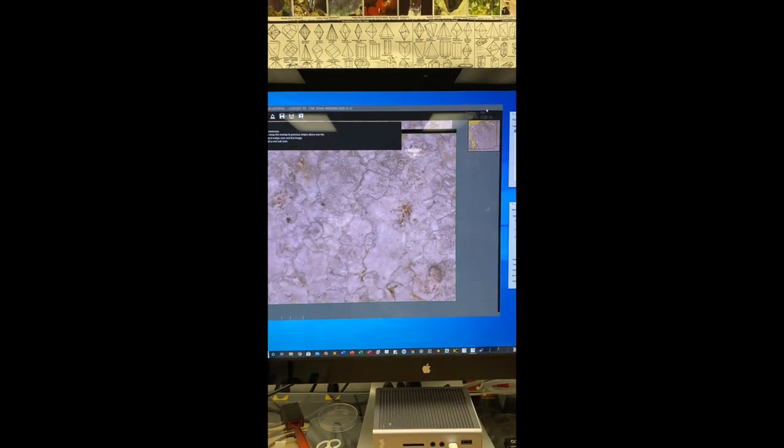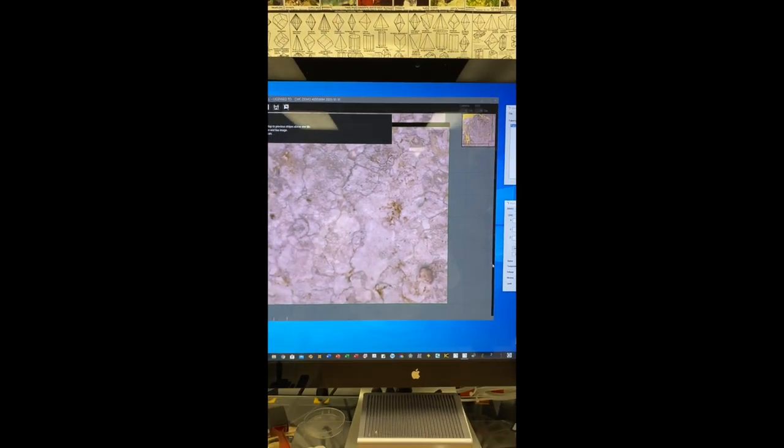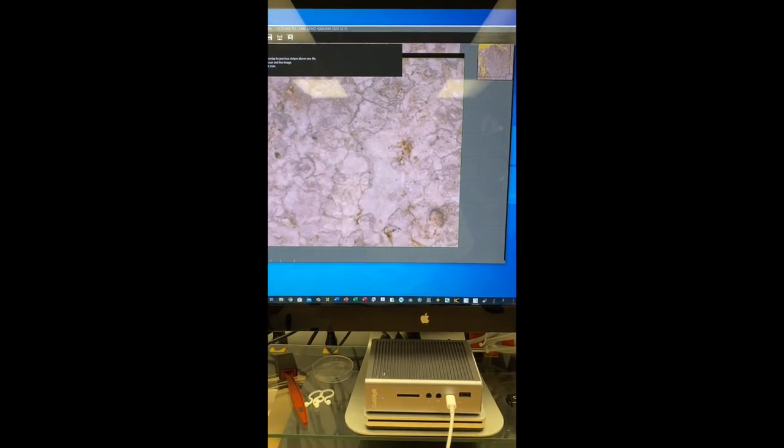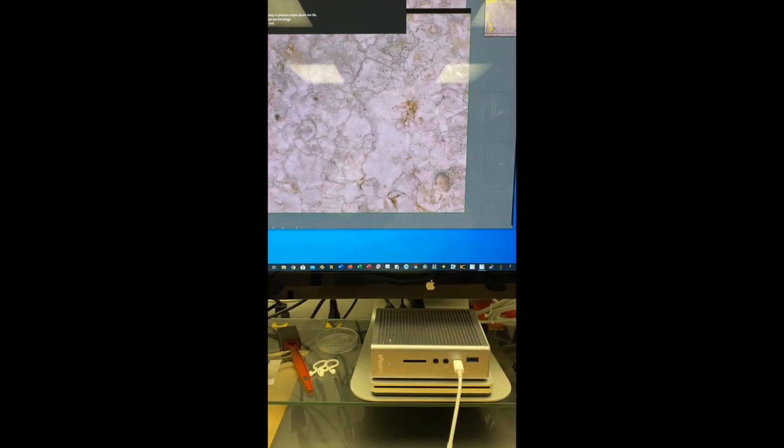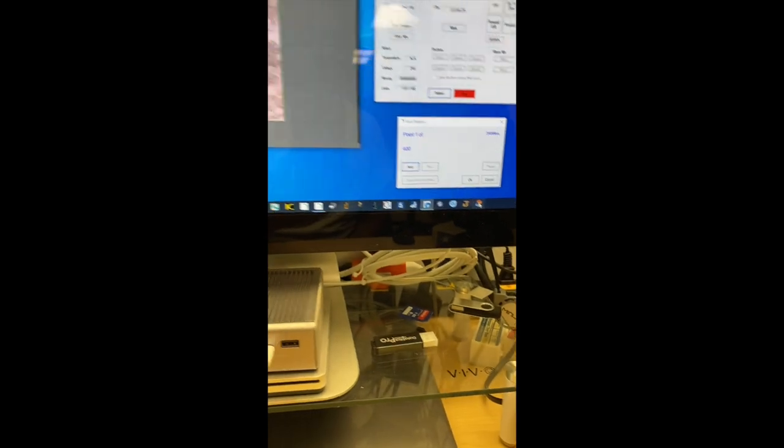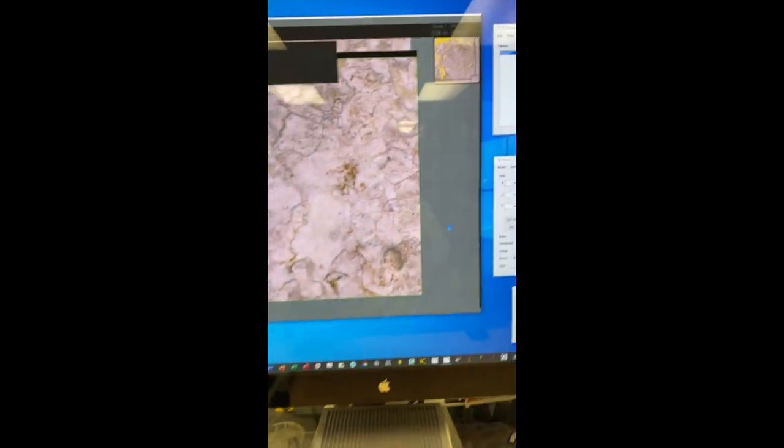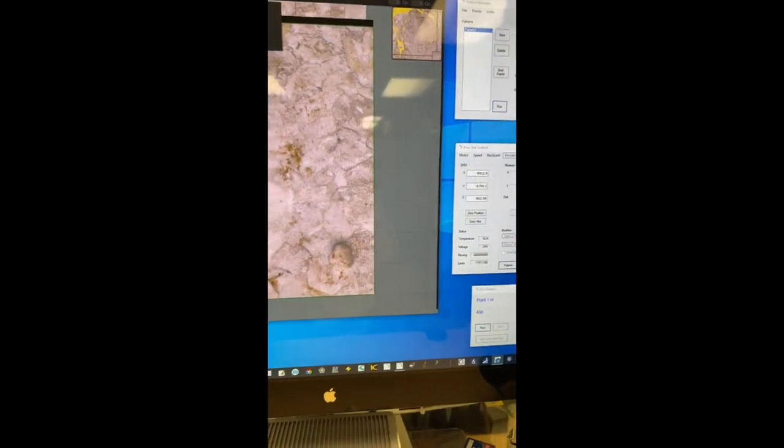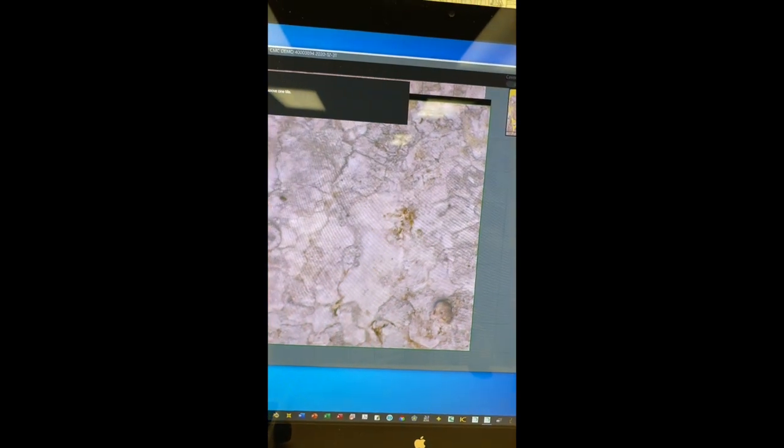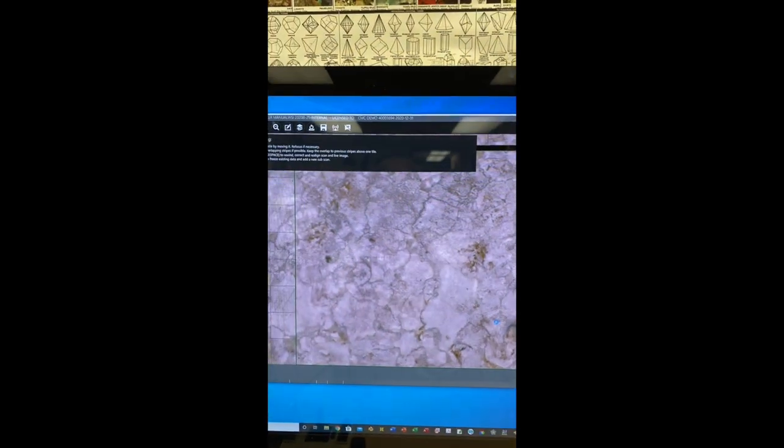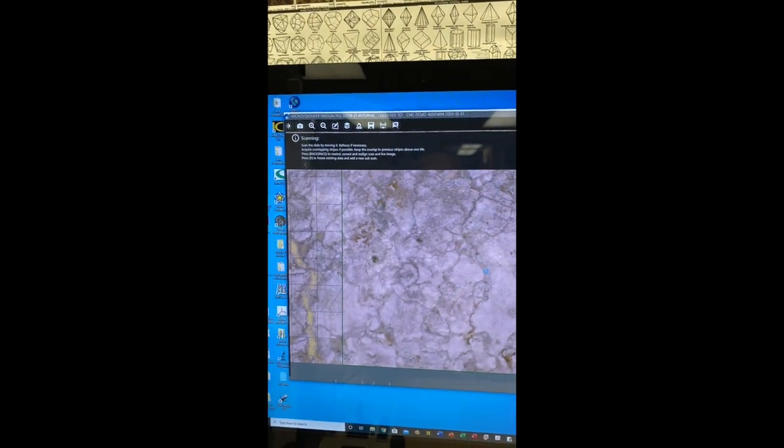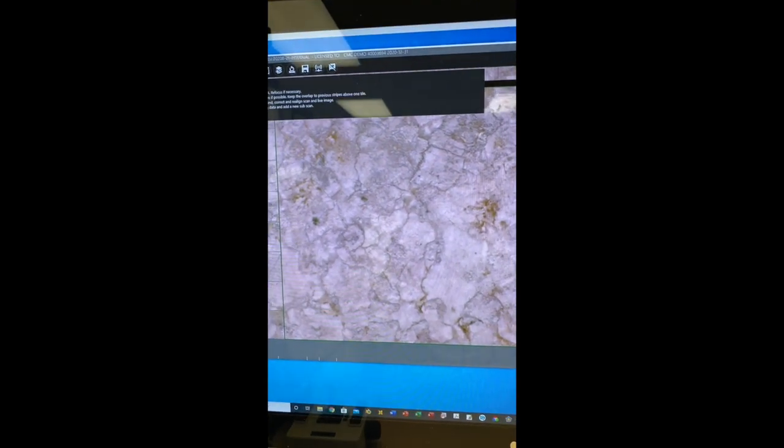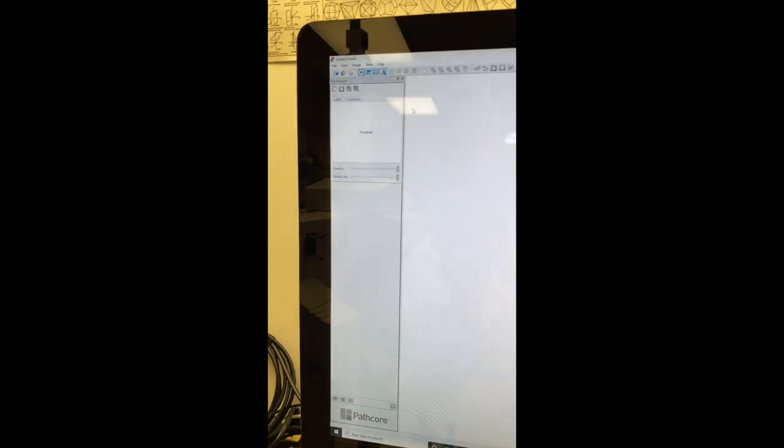And then view it in a whole slide image viewer. There are many whole slide image viewers available for viewing the Microvisioneer scanned images like QuPath or Sedeen. I'm opening the Sedeen viewer.